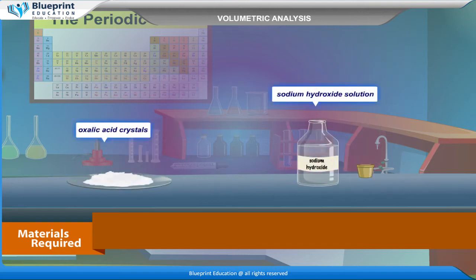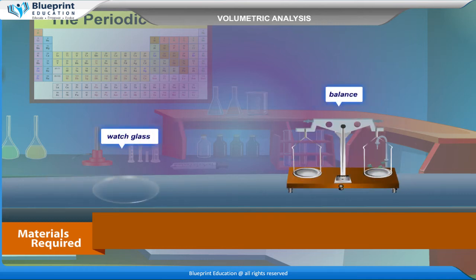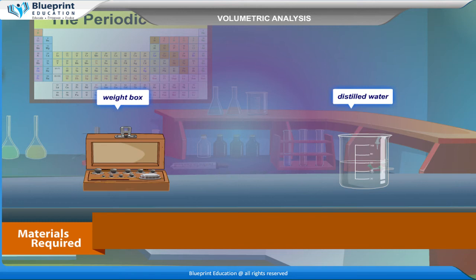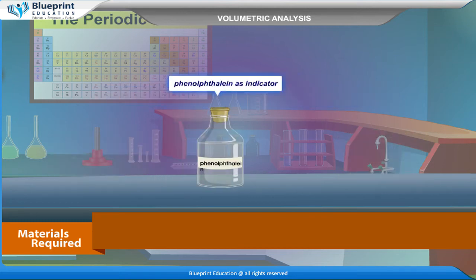Oxalic acid crystals, sodium hydroxide solution, watch glass, balance, weight box, distilled water, and phenolphthalein as indicator.